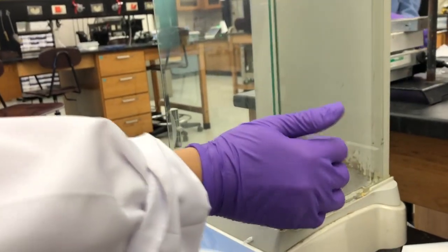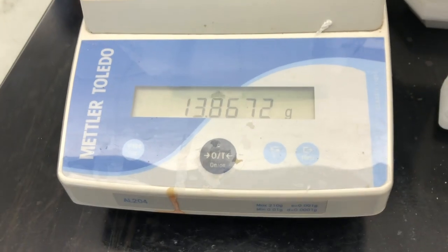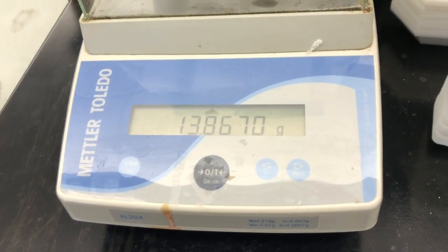Re-weigh the vial that now contains your product. Use this data to calculate the yield. My partner and I obtained approximately 0.7566 grams.